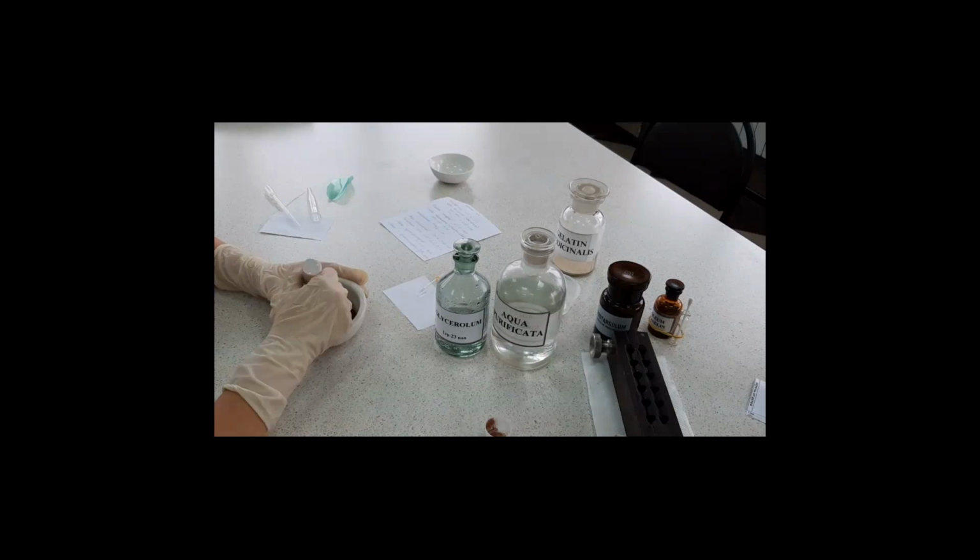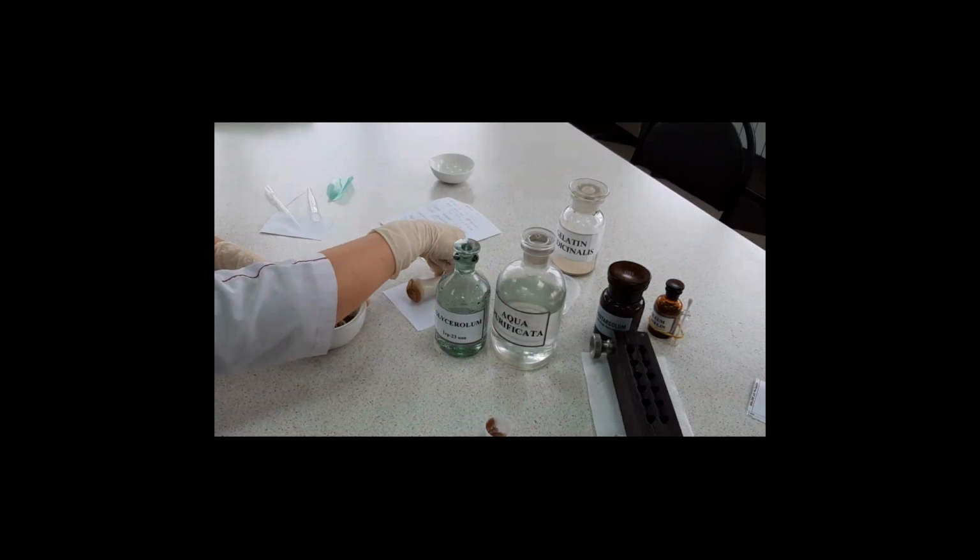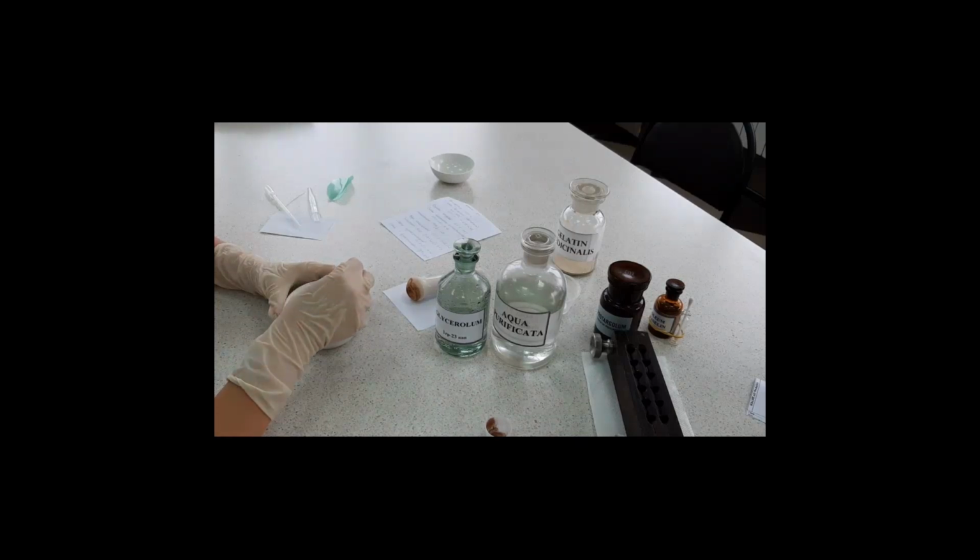Grind protargol in a mortar, firstly in dry form and then with 3-4 drops of glycerin and a few drops of water.